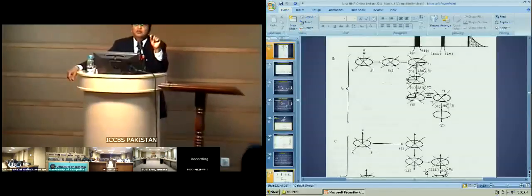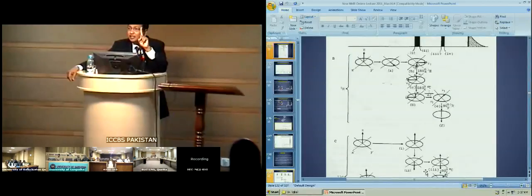Selectively one proton, you do everything with that one proton's frequency, and the population of that one proton is transferred to that one carbon which is coupled to it. As a result, you see the signal enhancement of only that one carbon. So you discover the coupling partner, proton and carbon, right?